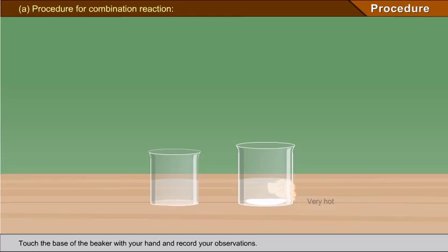When more water is added after every one minute, the mixture forms a thick white suspension and starts boiling, giving steamy vapor.